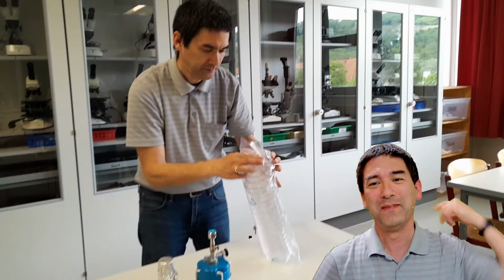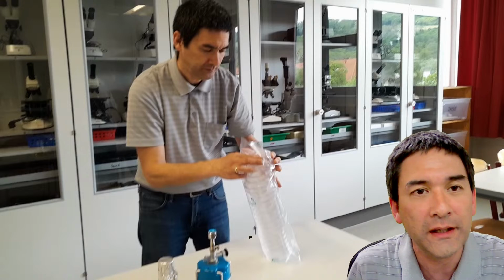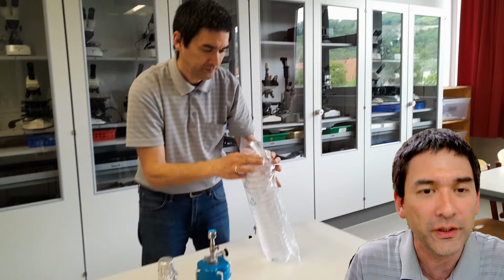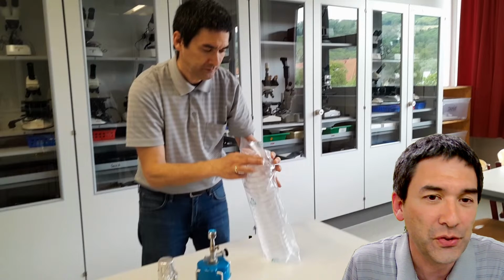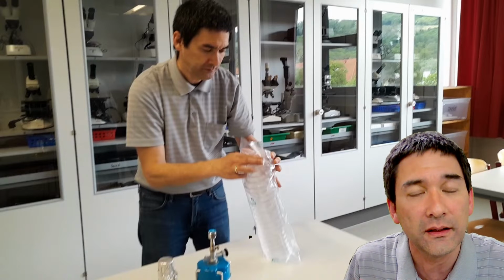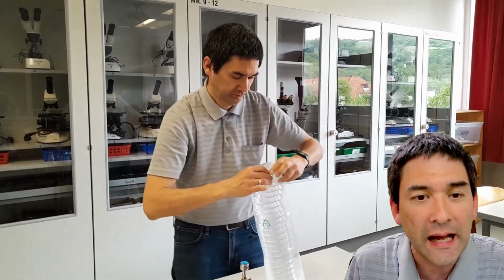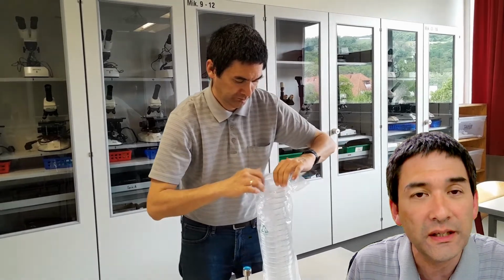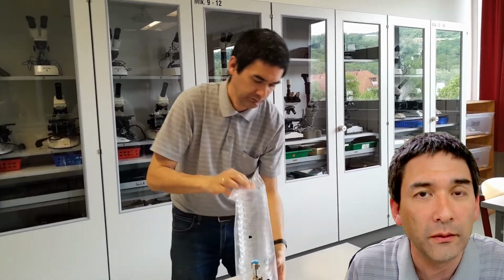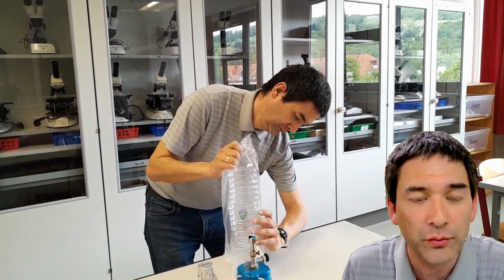Okay. So basically what I'm doing right now is making those petri dishes, and those petri dishes are packaged sterile. This basically means that they're free of bacteria. You have to open them, and the gas flame next to it is really important for making sure that no bacteria are able to fall into those petri dishes.